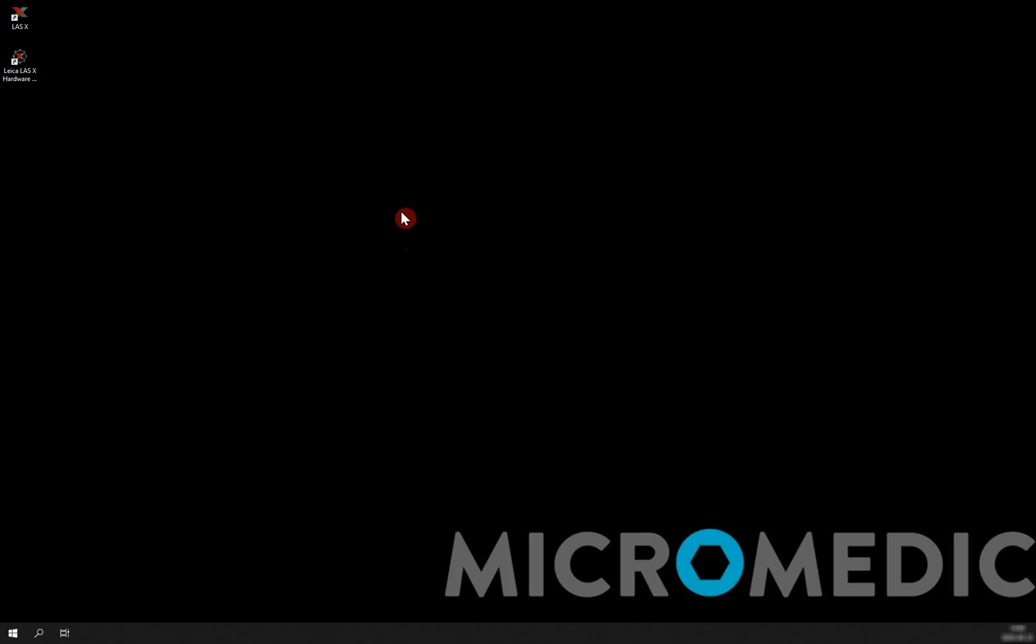In this video, I am going to show you how to set up your manual Leica stereo microscope. And by manual, I mean a stereo microscope that has nothing connected to the computer other than the camera.